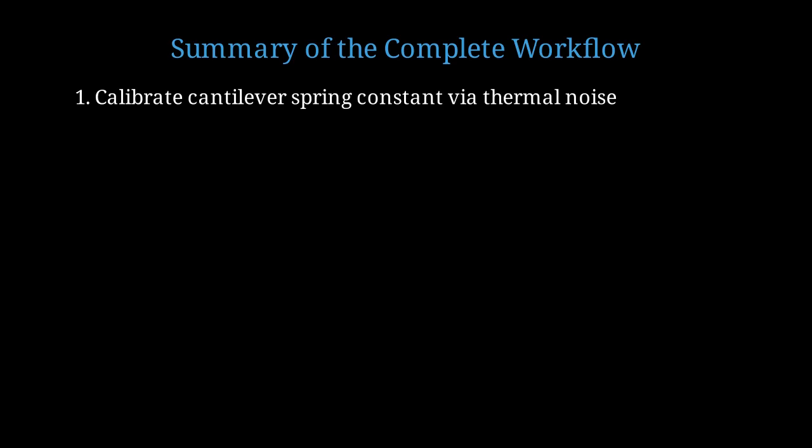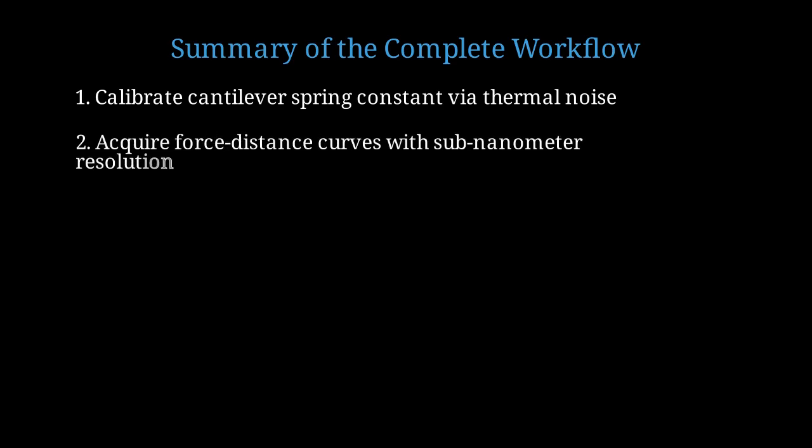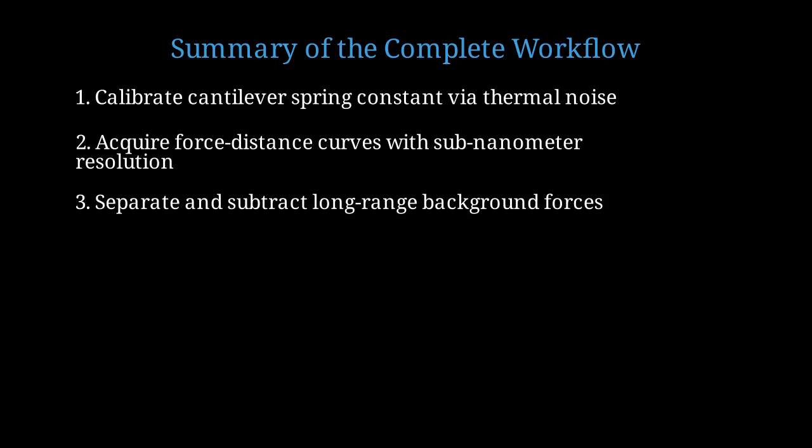Let me summarize the complete workflow we've covered today. Step 1. Calibrate your cantilever spring constant using thermal noise analysis. This is the foundation of all quantitative measurements. Step 2. Acquire force distance curves by approaching the tip to the surface while recording deflection. Aim for sub-nanometer resolution in both force and distance. Step 3. Identify and subtract long-range forces like van der Waals and electrostatic interactions. Fit the non-contact region to an appropriate model.